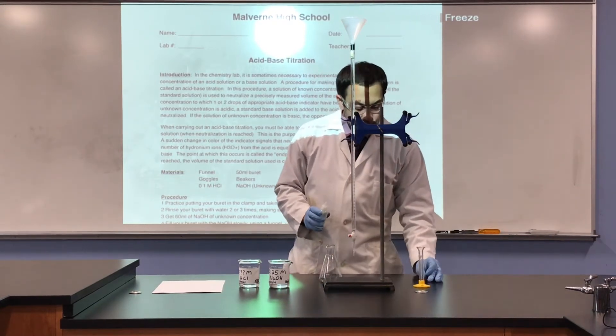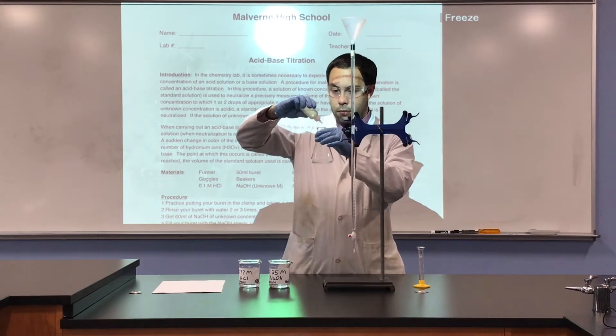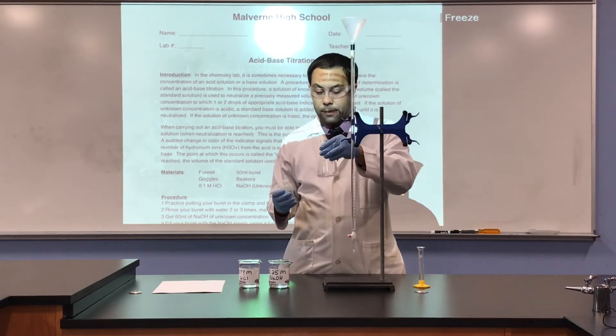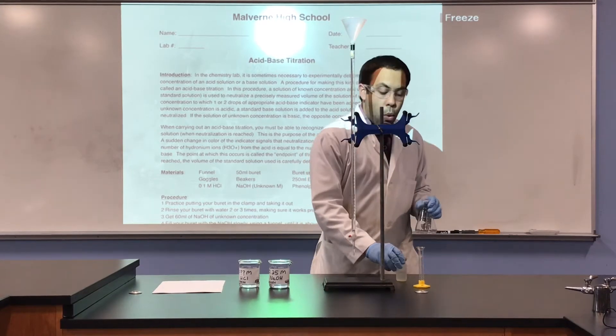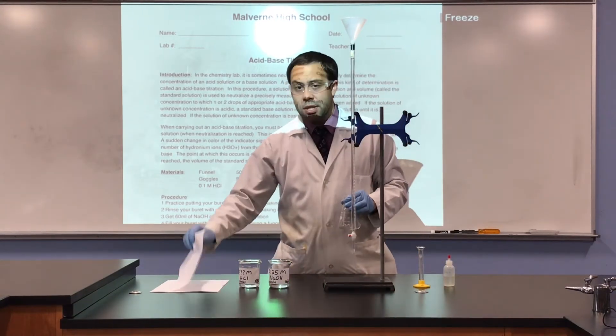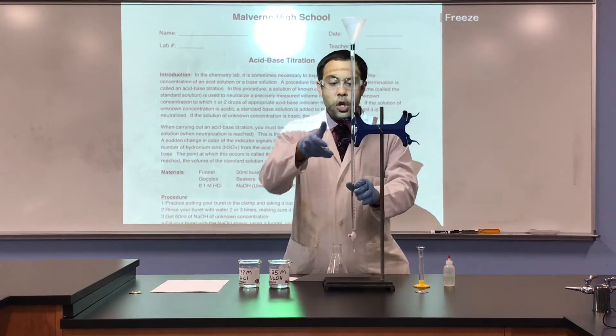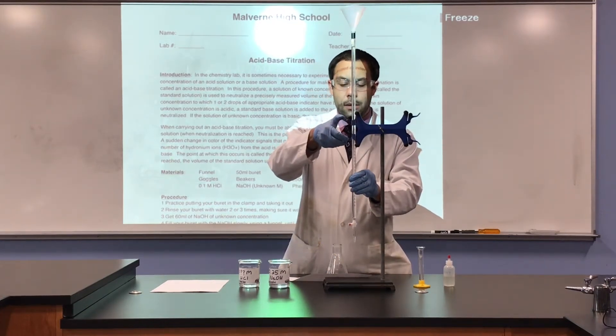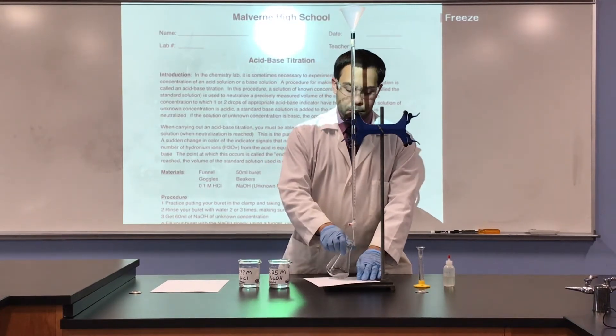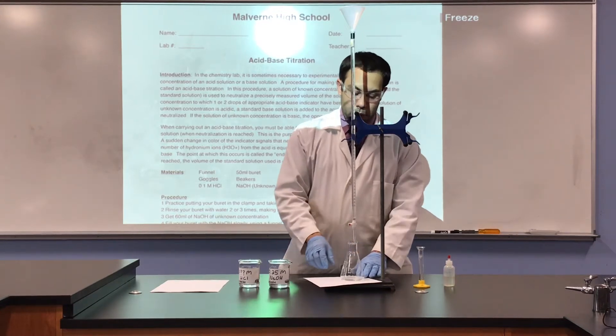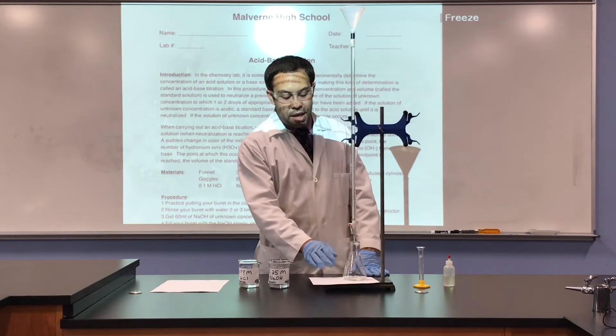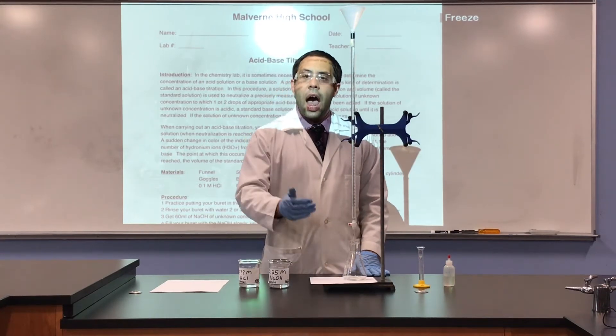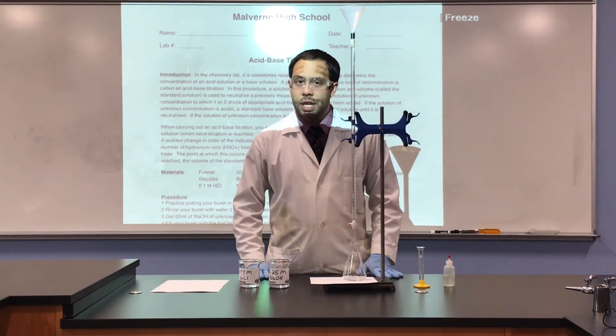Set the graduated cylinder aside for later. And also add two drops, or three drops in this case, of phenolphthalein. We're also going to use a piece of computer paper so we can determine when the phenolphthalein turns a light pink. It will be easier to see off of this white background. I'm going to move the camera closer so we can see the procedure.